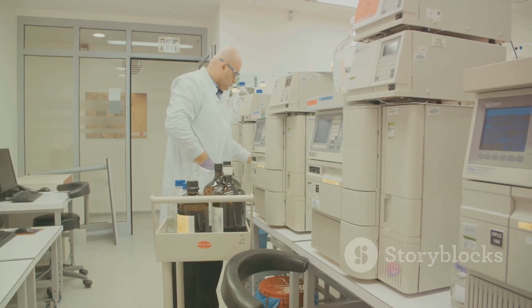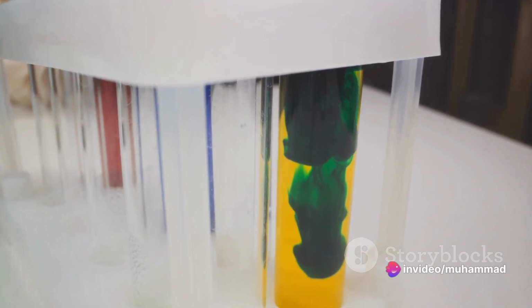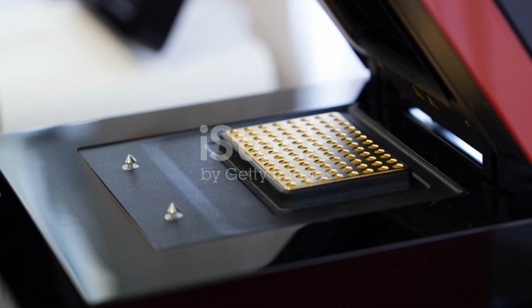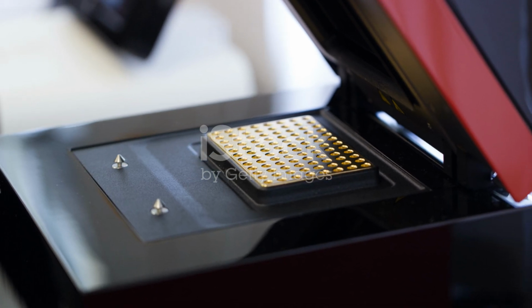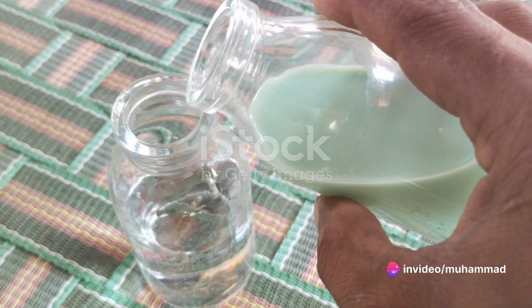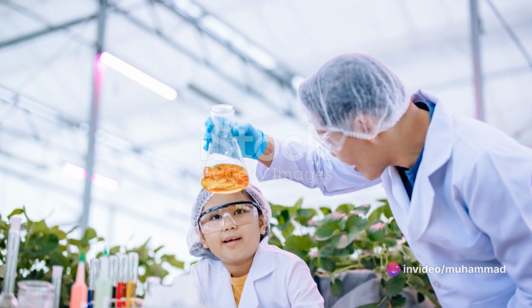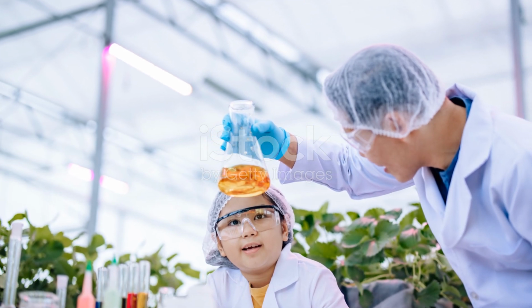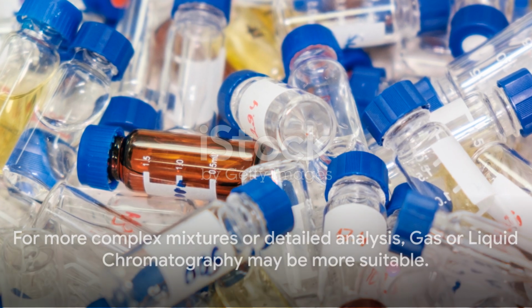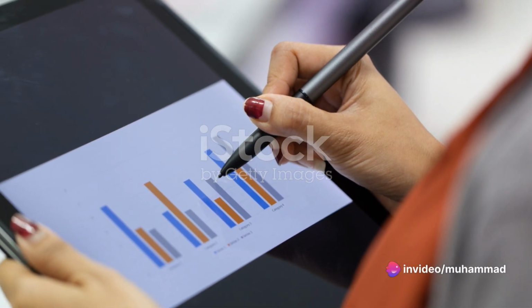So, how do these two types compare to the first two we discussed? Well, both paper and thin layer chromatography are simple and cost-effective, making them ideal for quick, rough separations. They also allow for visual analysis, as the separated components can often be seen directly on the chromatography medium. On the other hand, they may not provide the precision and sensitivity that can be achieved with techniques like gas or liquid chromatography, which are more suitable for complex mixtures or when more detailed analysis is required. So, four types of chromatography down. But wait, there's more.